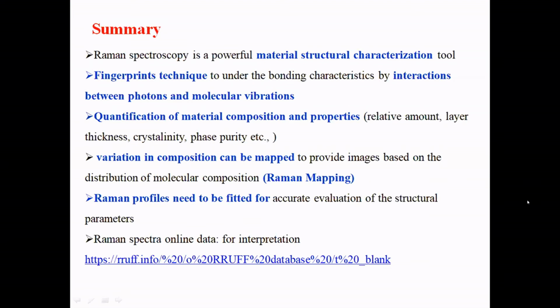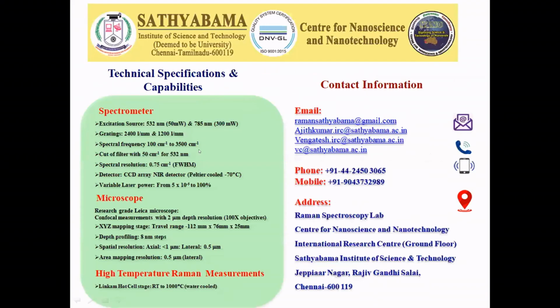Okay. And of course, these are all the specifications we have with our system, what laser we have, what the resolutions are, what capabilities the microscope has, and the high temperature mode and all. And you are all welcome to use it, or you can have all the access.